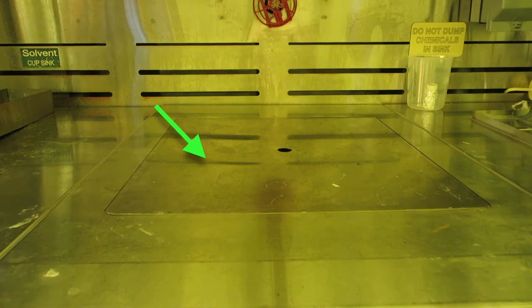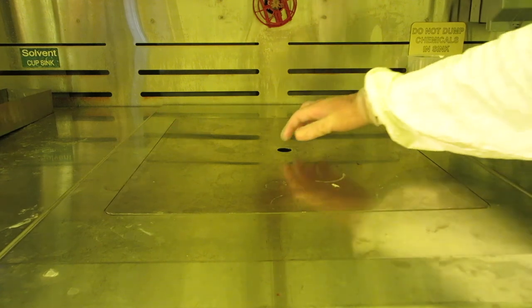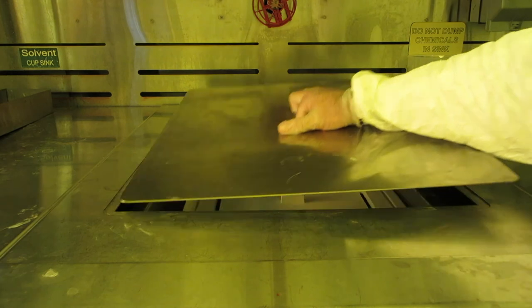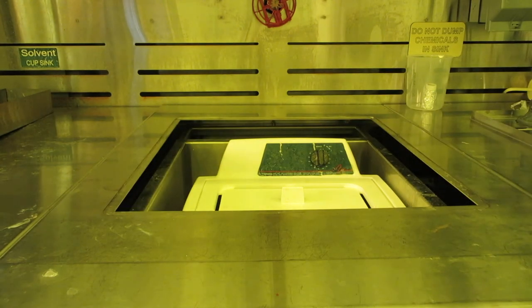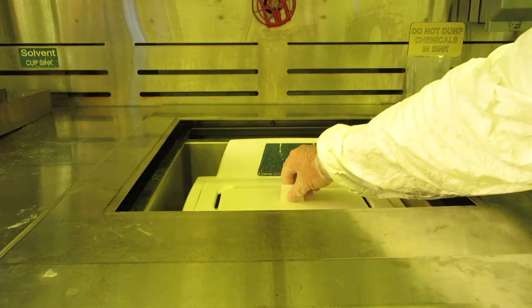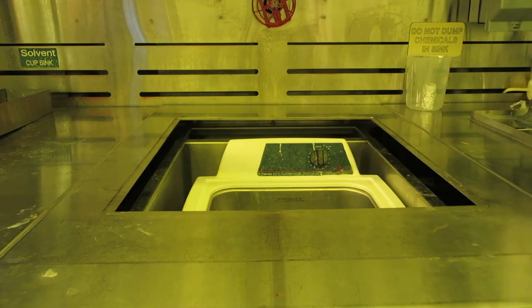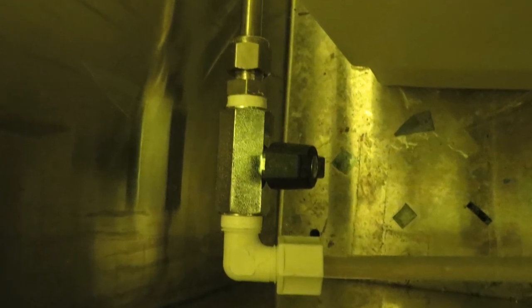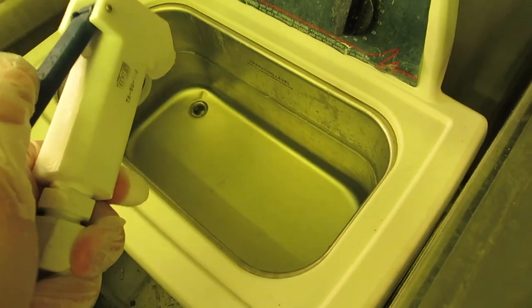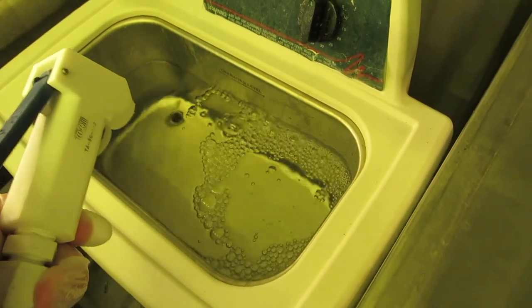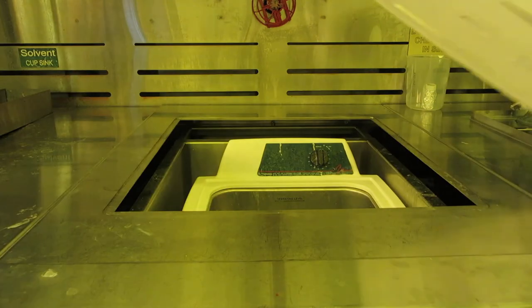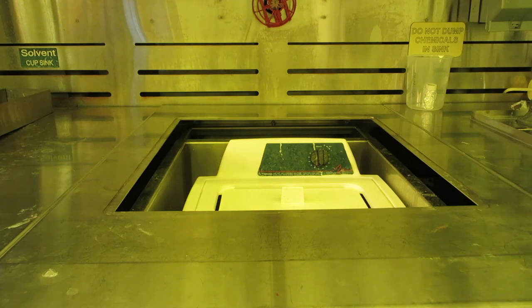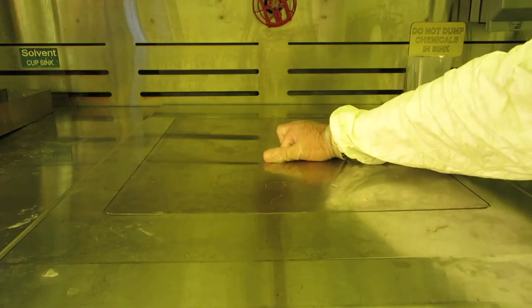Under this panel is a hidden ultrasonic bath. There should always be at least an inch of water in it to keep the transducers from overheating. Your parts would normally go in a beaker full of solvent or detergent solution which you would place into the ultrasonic bath. If the water level is too high there is a drain valve down in front of it that drains very slowly. If you need to raise the water level use the DI water gun to fill it. When you're done using the ultrasonic cleaner, put the plastic cover over the tank and put the stainless steel cover back over it.